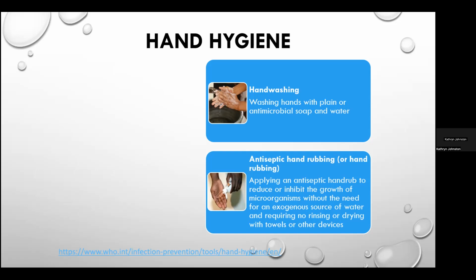And what I would like to stress at this point is gloves are not a substitute for proper hand hygiene. They are an adjuvant to the hand hygiene process. So no matter what you do, gloves or not, hand washing or hand hygiene with an alcohol-based hand rub are critical and do not ever get substituted by the use of gloves. So it's not either or there. If you're going to wear gloves, it would be in addition to the application of appropriate hand hygiene.